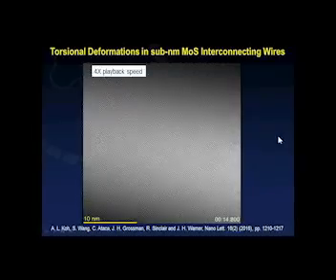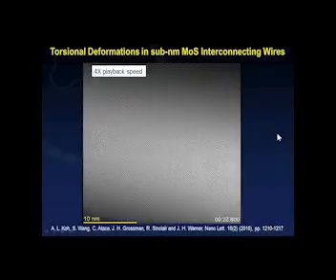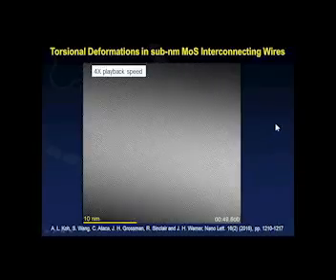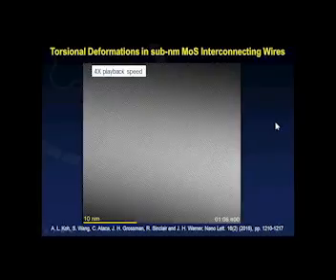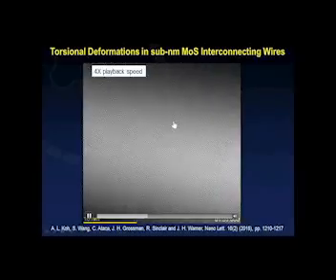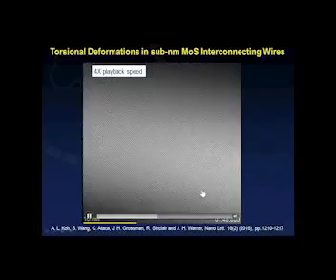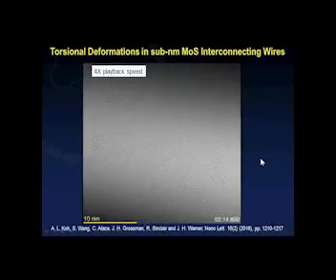And what happens is that during illumination under the electron beam, the electron beam induces sputtering of the sulfur atoms in the moly disulfide monolayer. And what you can start seeing is the gradual formation of what appears to be defective planes. And over the course of time, some holes start breaking up in these few areas, like over here.